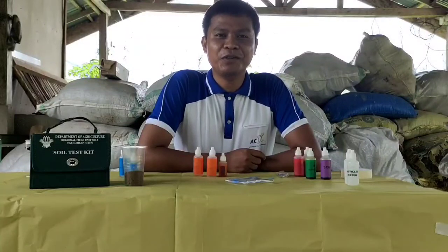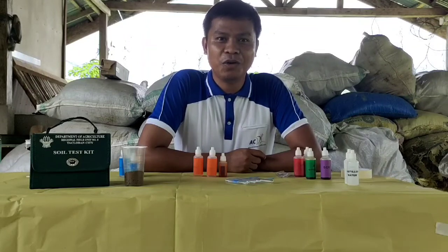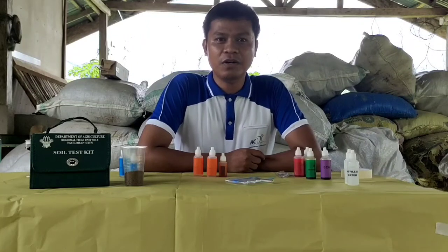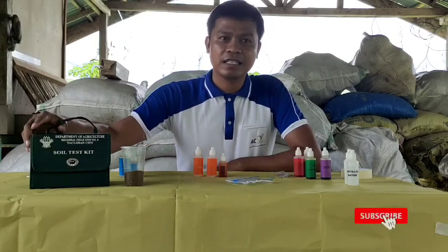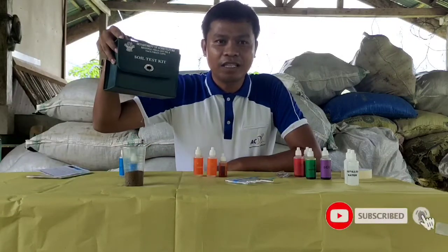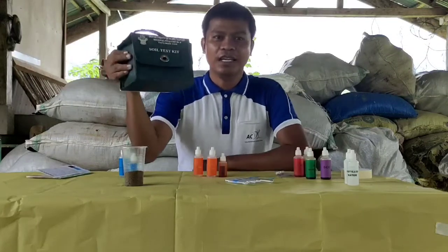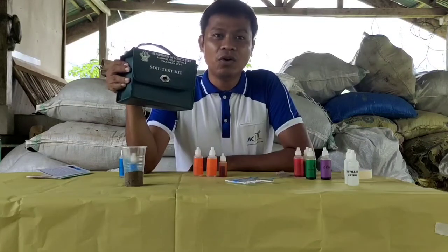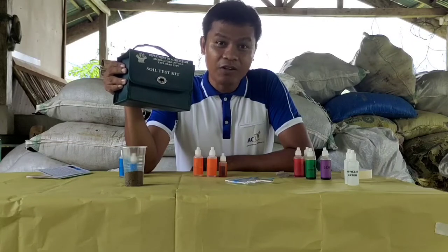Hello guys, good afternoon. Welcome to my YouTube channel, GVE Travel Vlog, Agri Edition. In this afternoon, we will be analyzing a soil sample using this soil test kit from the DA or the Department of Agriculture. This tool is a quick method of evaluating the soil fertility status of our soil.